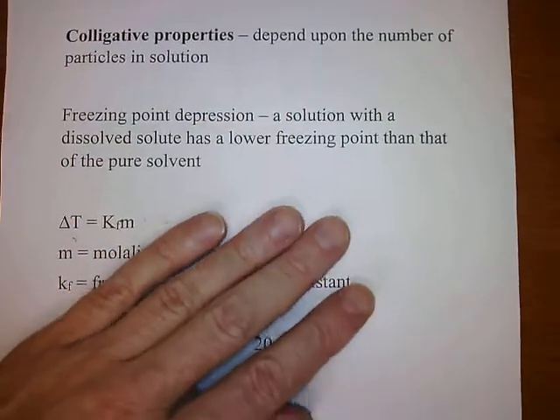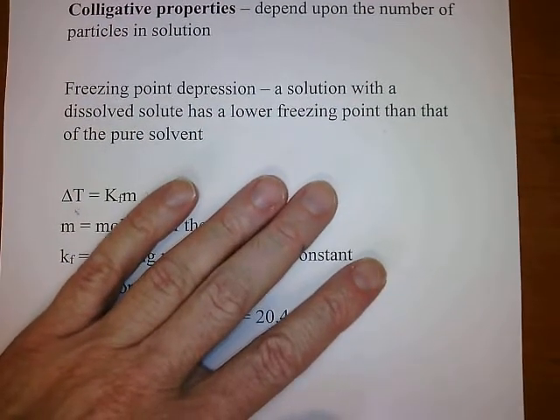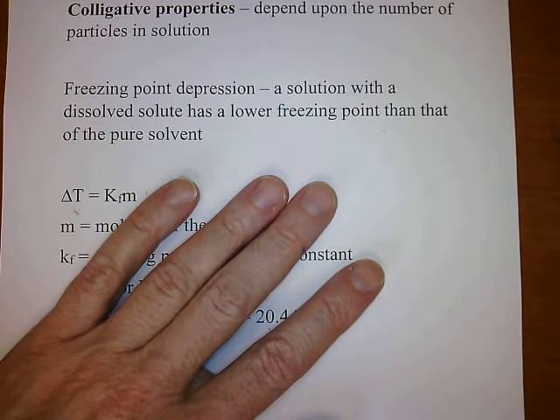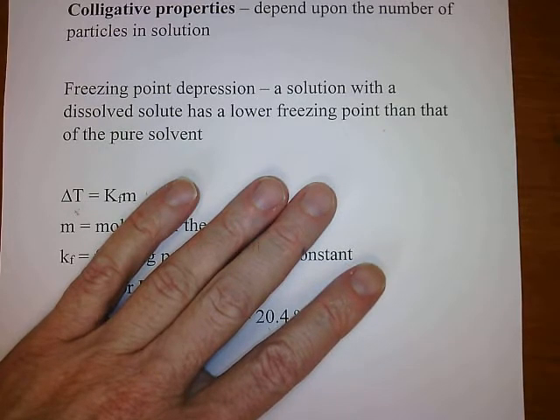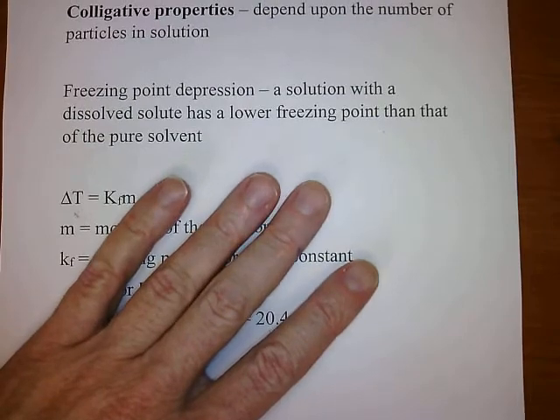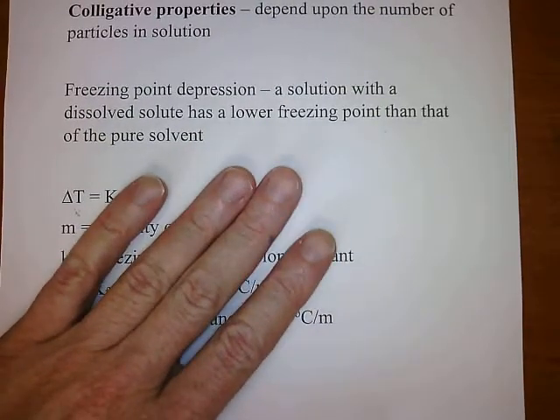One of these is freezing point depression. A solution with a dissolved solute has a lower freezing point than that of the pure solvent. That's one of your colligative properties. You lower the freezing point.